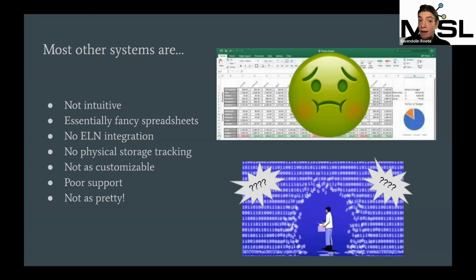And I really must say that the LabKey team has been fantastic. I love that they're local to the Seattle area and are always there to answer questions right away. And of course, not as pretty, which I think Sample Manager is a really gorgeous piece of software too.